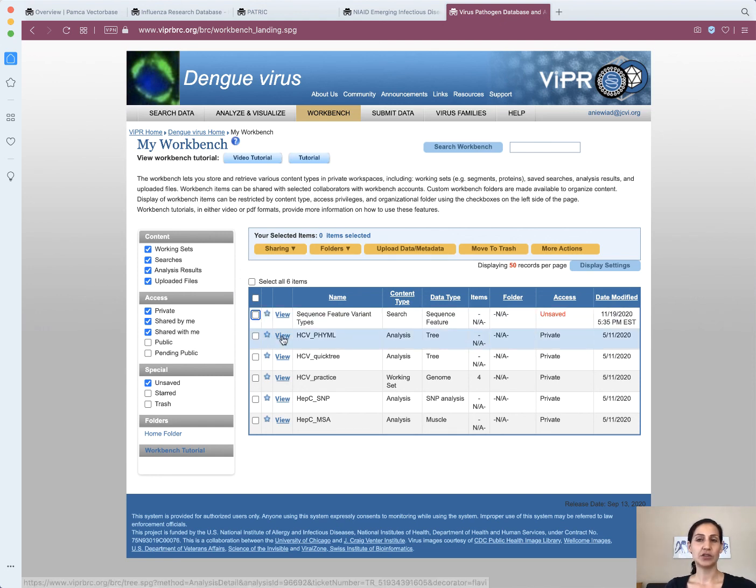You can create shared folders. This is really helpful for those of you who have international collaborators and you don't want to just spend time transferring large data sets. And it's extremely handy in countries where low bandwidth is a problem.